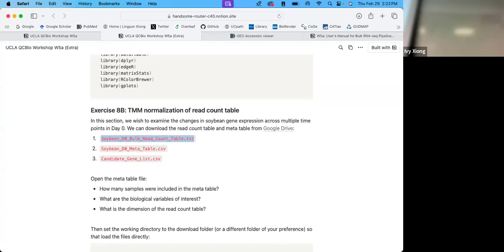Try the edgeR. I think it's the library. Do you have Xcode?